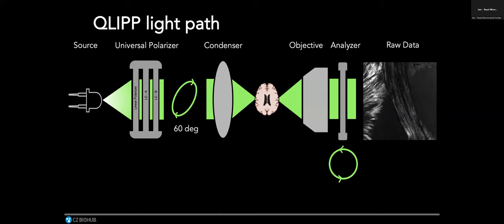In addition, this image has information about the density and the absorption. So the raw images that we acquire in any polarization microscope have a mix of information. They contain a mixture of contrast because of absorption by the sample, phase by the sample, and the anisotropy of the sample. So the reconstruction algorithm really disentangles this information. It takes this diversity of data and processes it to disentangle all of that information. Now, this method was established, called LC-PolScope, and has been around for a long time.